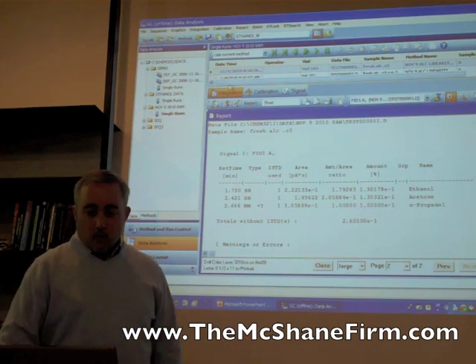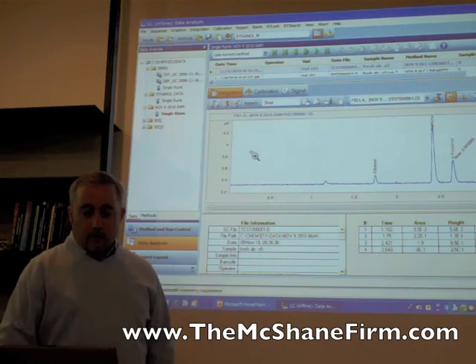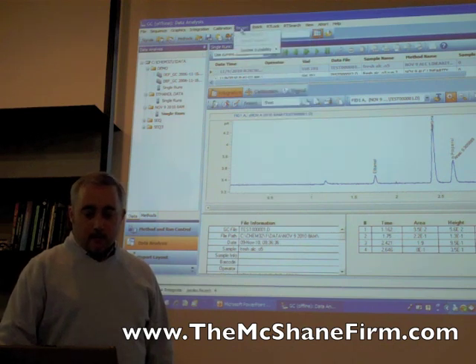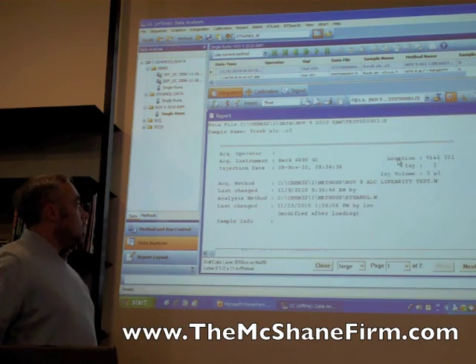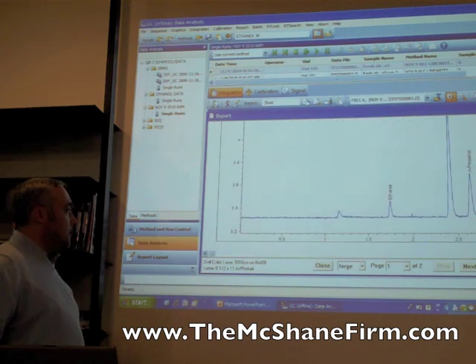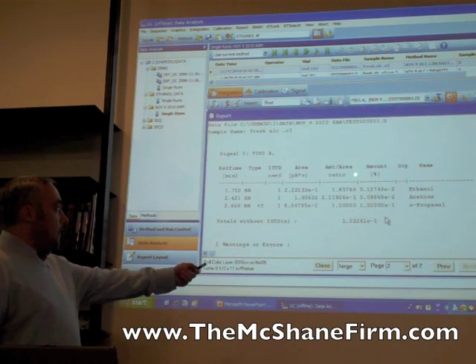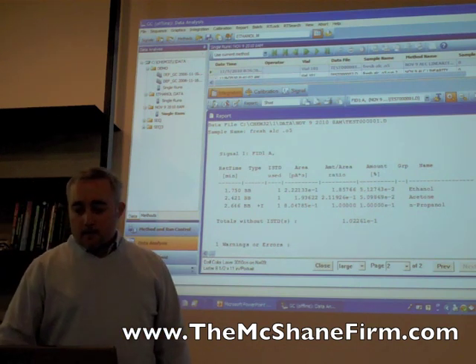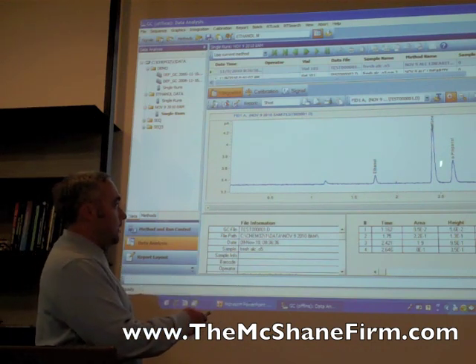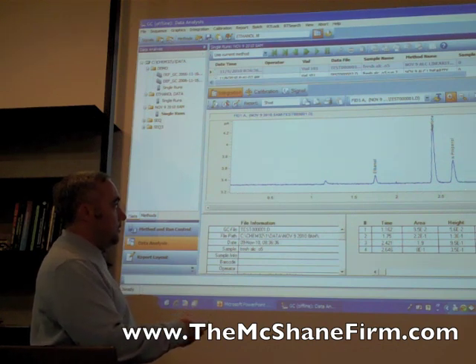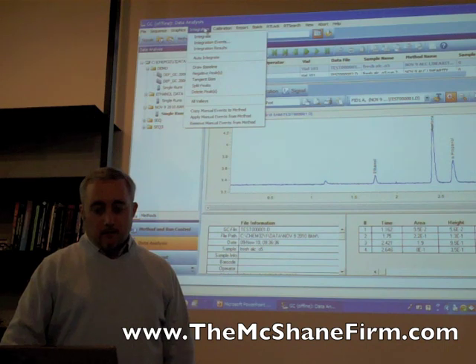Now we do something more devious. We reset the parameters back to their original state — hit Auto and Integrate to move it back to the reporting level of 0.05, hit Print Report, and we're back to the chromatogram showing 0.05 with no changes to the underlying data. No baseline, no sideways mark. So how can you reduce the calculation but not affect the chromatogram so it's indistinguishable — unless you get the raw data to see what the integration parameters are?